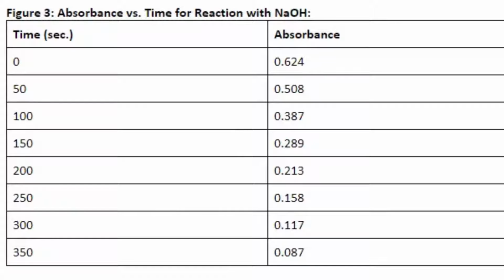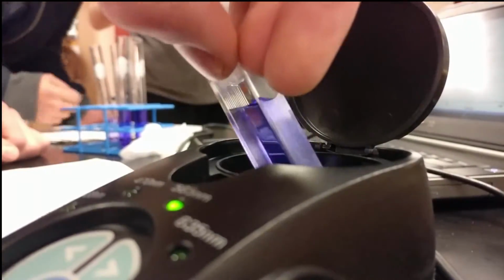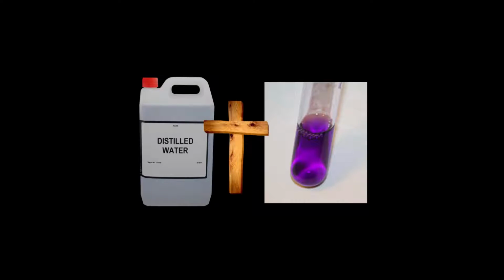The initial concentration of crystal violet used was 20 micromolar. This concentration was chosen because it would allow for a reaction rate that was fairly quick and an absorbance that was close to 1 but did not exceed 1. 10 milliliters of 5, 10, 15, 20, and 25 micromolar of CV were produced using the distilled water and 25 micromolar of standard solution of CV.